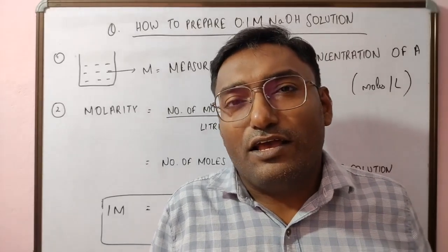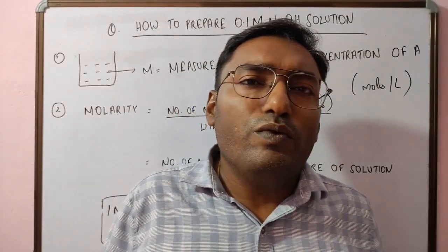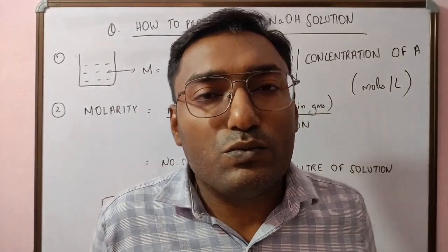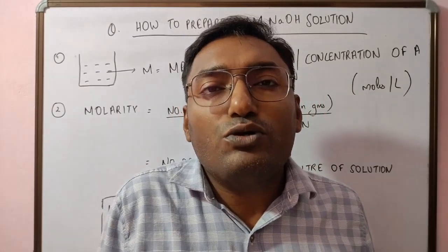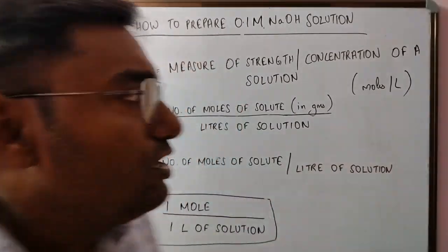Welcome to the class. In the calculation of the assay of ibuprofen, we first need to prepare 0.1 molar NaOH solution. In this video class, we will learn how to prepare 0.1 molar NaOH solution.